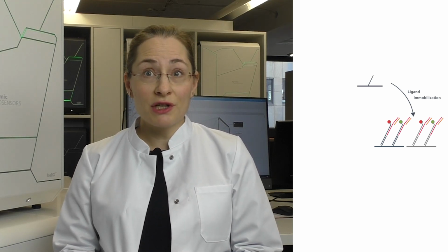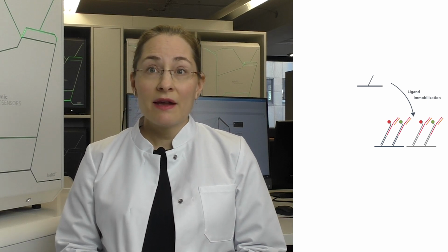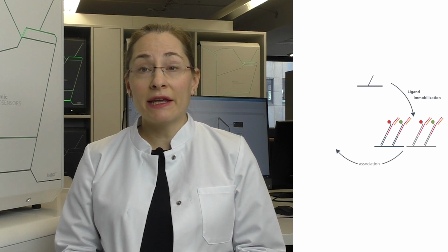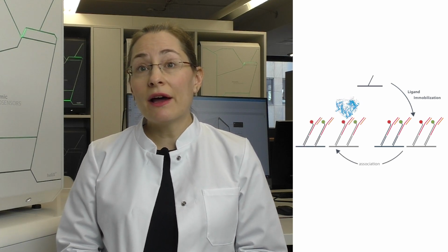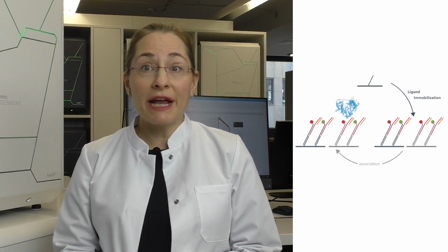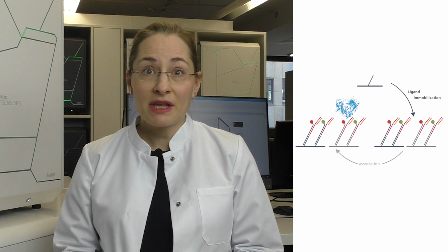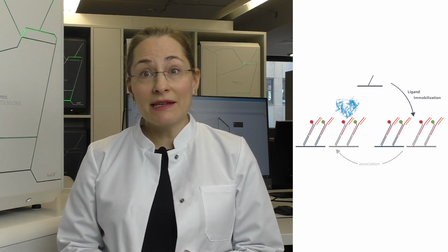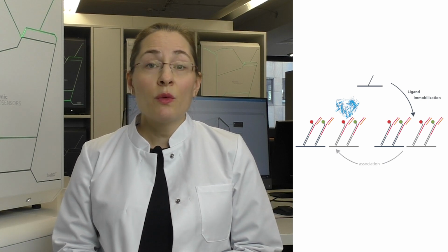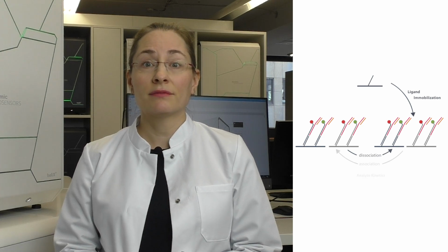After the surface is functionalized, we want to flush in the analyte, the T7 RNA polymerase. This will be the association phase of the kinetics. By presenting the DNA oligos on the surface, we allow the DNA binding protein to freely move in solution without the need for any modification or restriction of conformational changes while binding. The association phase is ended by the injection of running buffer, and while that is flushing over the sensor, we can observe the dissociation of the polymerase from the DNA.